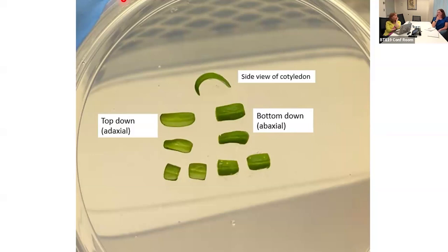Yeah, the treatment might have been too harsh, too much bleach, or not enough.